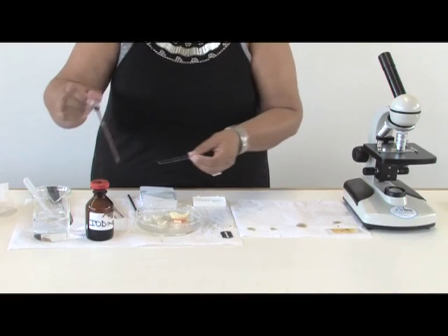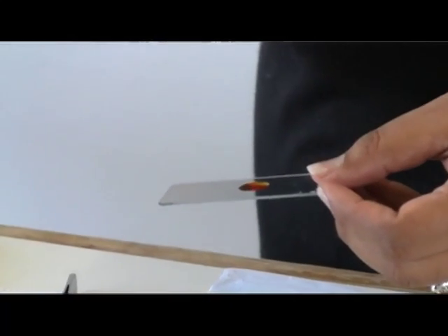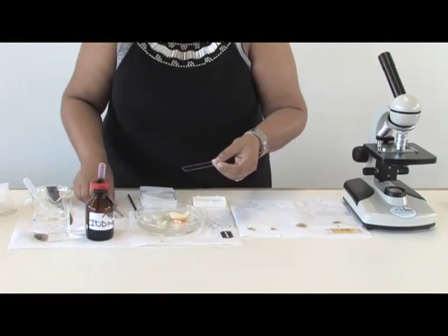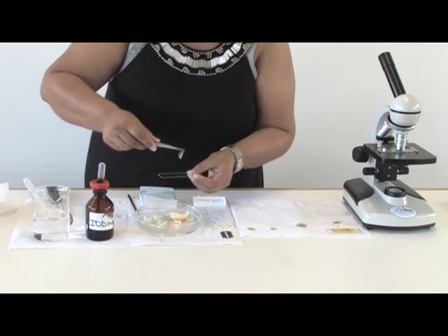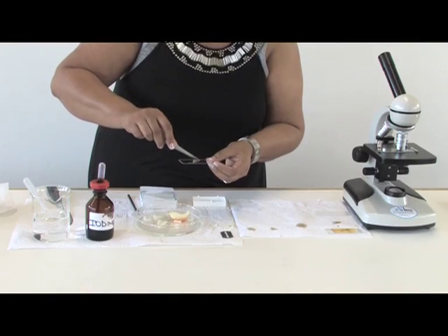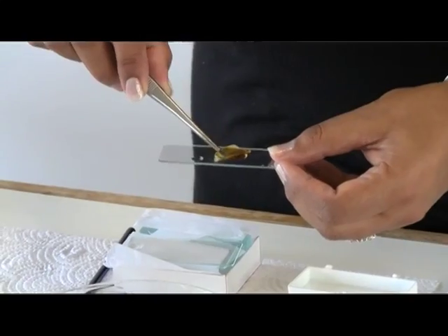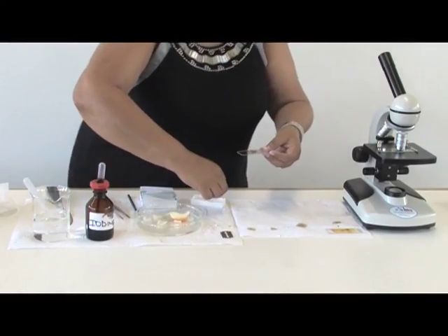Beforehand, place your liquid onto your microscope slide — one or two drops. Then very carefully, not to let it fall, you try and put your layer onto your microscope slide and you cover it with the cover slip.